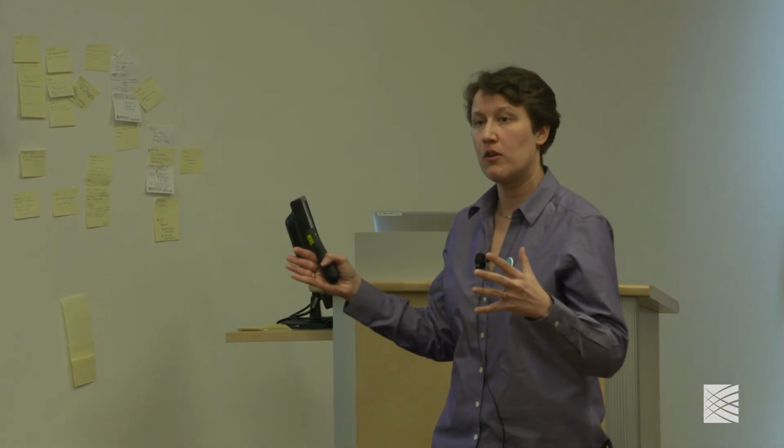It's really difficult, and that's why we have sophisticated filtering approaches, because it's true that you could still have something that by accident happens to be that way. And so we'll talk more this afternoon in the variant filtering part about how we can use statistical models to evaluate basically how worried we should be about this particular thing.